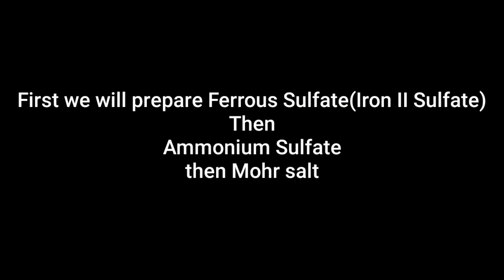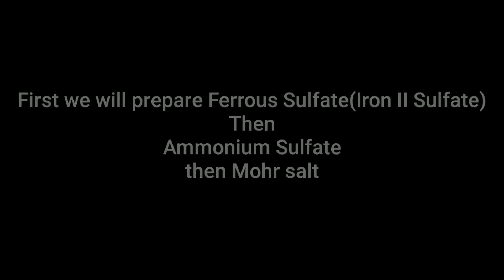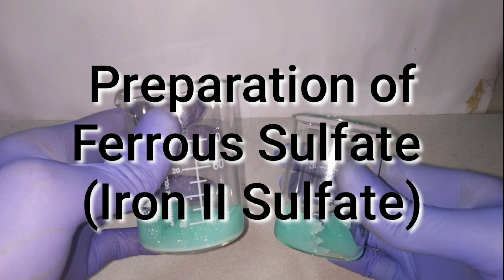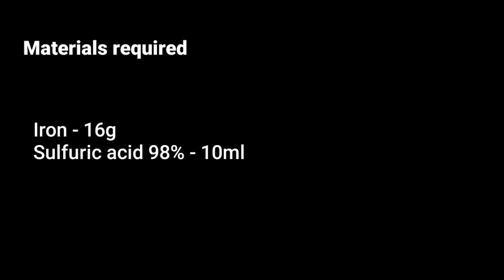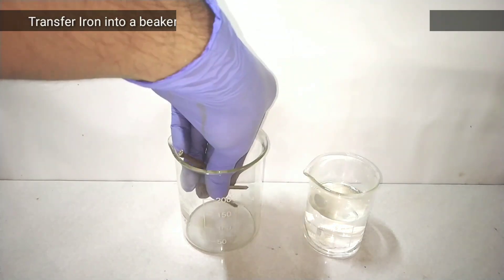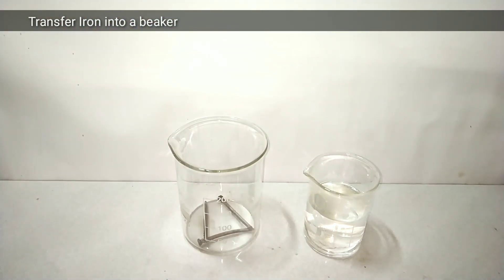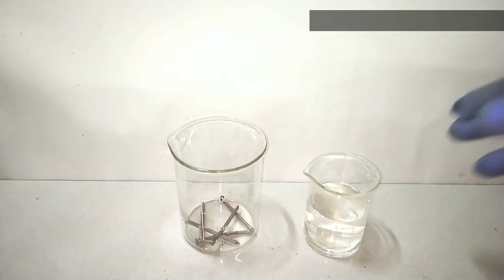In this video we will be preparing iron 2 sulfate, then ammonium sulfate, and finally the Mohr salt. First let's prepare iron 2 sulfate. For this I need some iron. Here I am using iron nails and some sulfuric acid. First I transfer the iron nails into a 250 ml beaker.